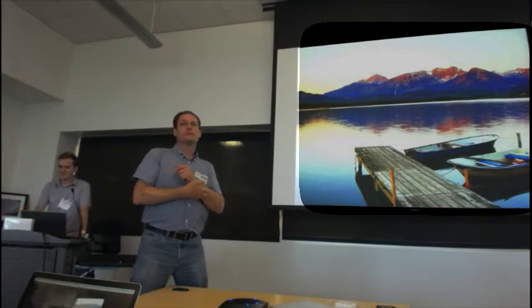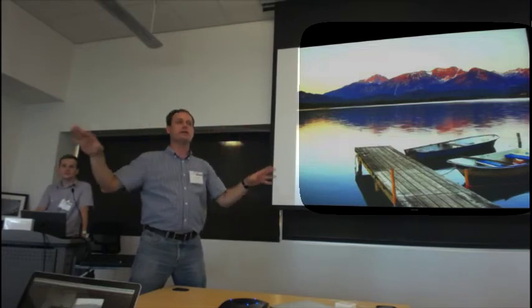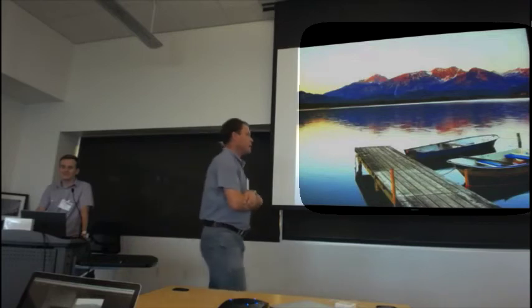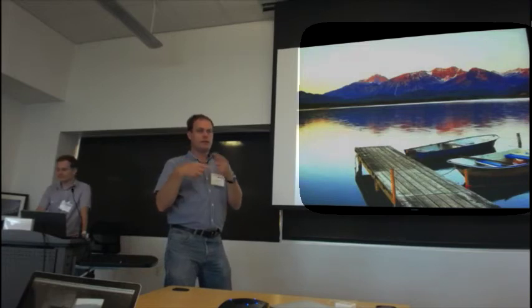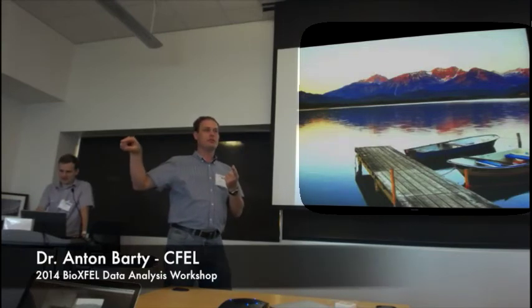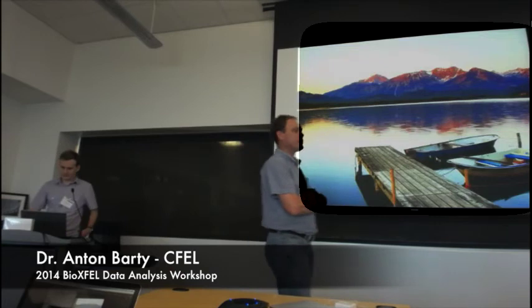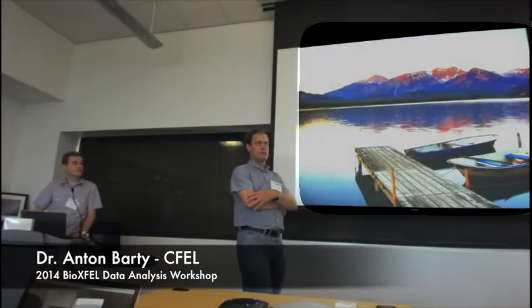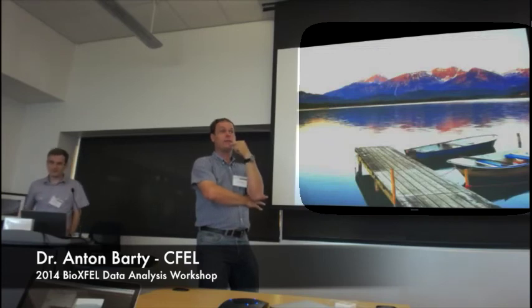We used to do a local background subtraction over the whole image, a moving window local background subtraction to try and flatten a lot of these artifacts and leave just the Bragg peaks. That ended up having some interesting feedback problems into the statistics, so we no longer do that. Even if we use it for the peak finding, we now output the data without that local background correction applied. But depending which data set you look at in the CXIDB, it may be from when we used to do that processing. For example, the CXI 22011 data set, the Butte lysozyme, was probably done using a lot of these rough and ready tricks back when that paper was published.